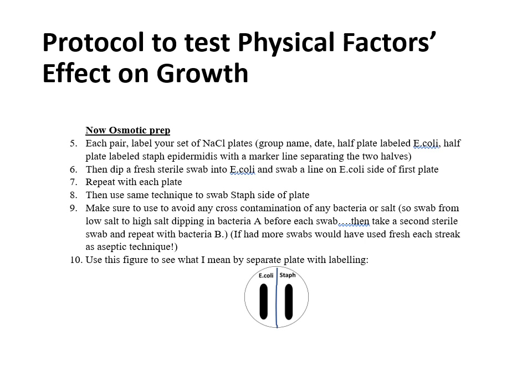You would then set up osmotic prep by having multiple different agar plates, and each agar plate is made with a different amount of salt in it. So each semester we use slightly different percentages, but usually we'll have a lower percentage such as 0.85% or 1% salt, even 2% salt.